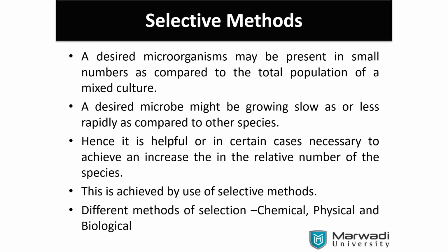So what is going to happen? Some bacteria start to grow over there. They will take it as their nutritive material, they will digest it and they will grow. So what we can do, from the same place, we may isolate some water sample. We may take the water sample. You may go to the sea also, that is marine water.